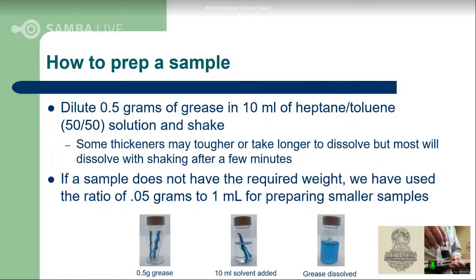But you won't always see the sample looking like this. This is one of the ones we set up for Lisa to test here in a few minutes. But here's another sample, and you might think this is from a new sample, but it's not. It does have a lot of that original color of that grease still present in this diluted state, but there is quite a bit of metallic content nonetheless.